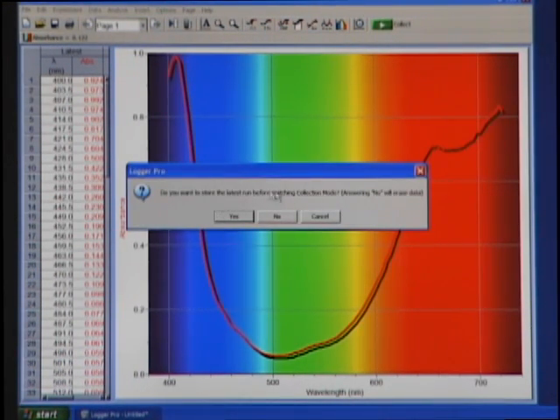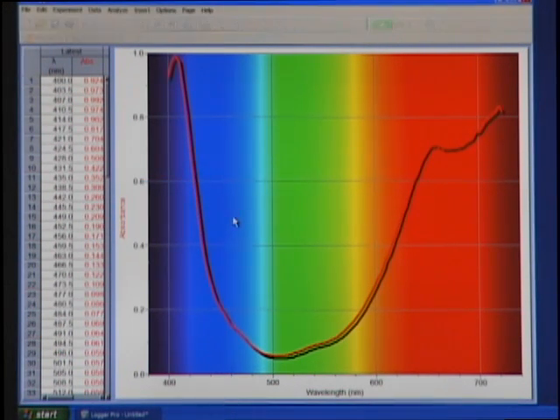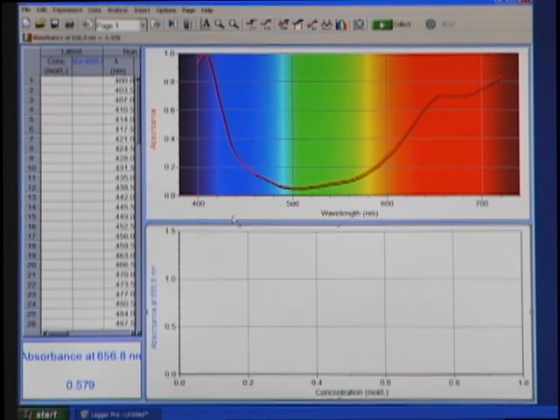Do you want to store the latest run before switching to collection mode? Yes. By choosing to store that run, I keep a history of what's happening in this experiment. I've got, actually for a lab report, for example, I've got the full spectrum graph that I might want to include.